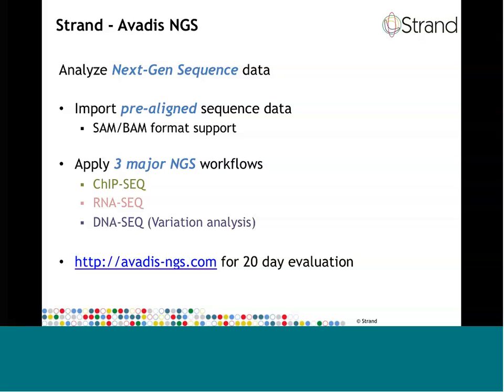For instance, the Illumina version of CASAVA due out in February, version 1.8, will adopt the SAM-BAM format as the only exchange format, relegating the export format to the status of internal exchange format only. For historical data that is not provided in the SAM-BAM format, there are a number of converters available that will quickly and without loss of information convert these data files into SAM-BAM format.